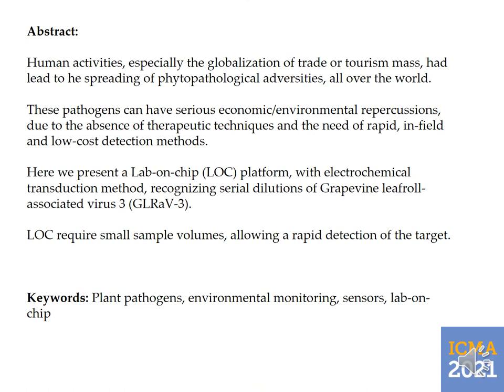Nowadays, human activities significantly contribute to the worldwide spreading of phytopathological adversities, especially if we consider the globalization of trade or tourism mass. In particular, pathogen-related food losses are today responsible for a reduction in quantity and quality of yield, with serious economic and environmental repercussions due to the absence of therapeutic techniques. As a result, there's the need for rapid, in-field, and low-cost detection methods, especially for emerging diseases or pathogens that spread thanks to asymptomatic individuals with subtle initial symptoms, but are then difficult to face.